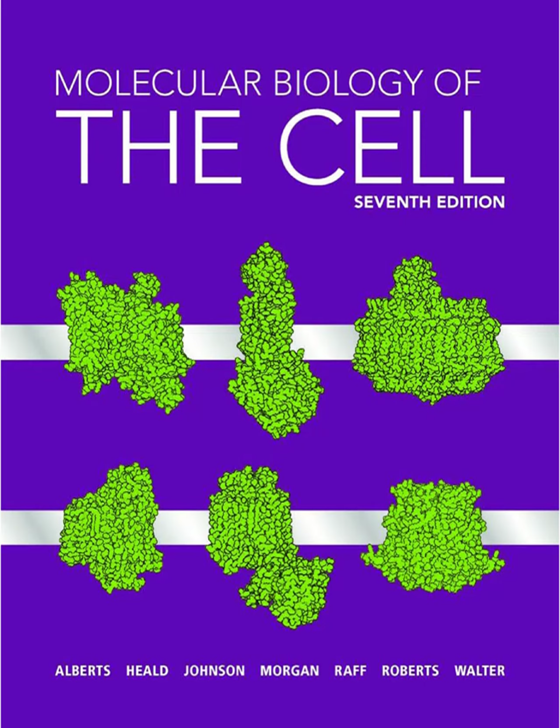So to wrap up, this whole deep dive highlights that central theme again: trade-offs. Absolutely. Every single technique we discussed involves compromises. Want high resolution? It probably means more complex sample prep, maybe no live cells, higher cost. Want live cell dynamics? You might sacrifice some resolution or can only look near the surface. Want specific molecular identity? You label it, but then the unlabeled context might be hidden. It's always a balance. Contrast, resolution, signal to noise, speed, how deep you can see, how much damage you cause. Improving one often means sacrificing another.